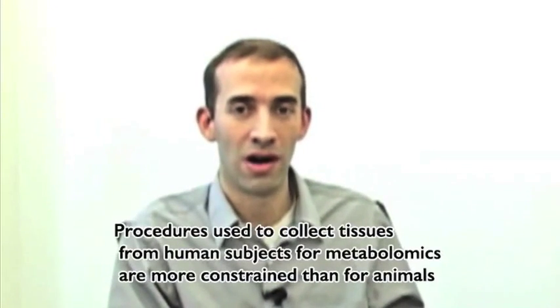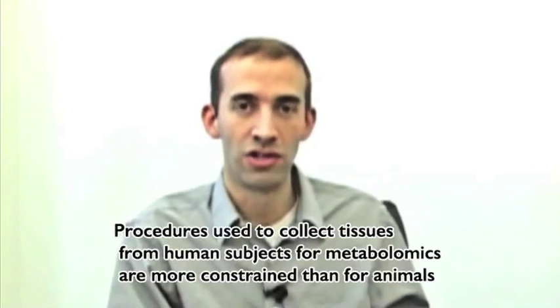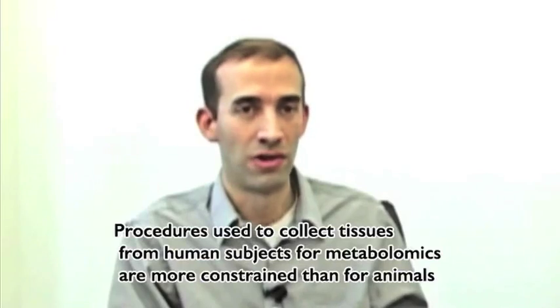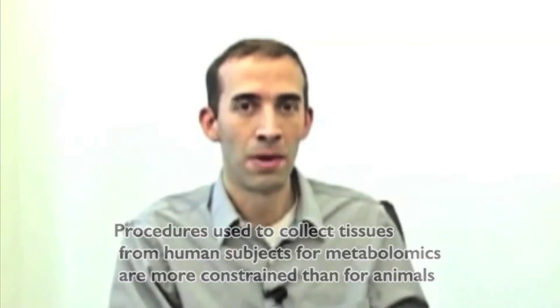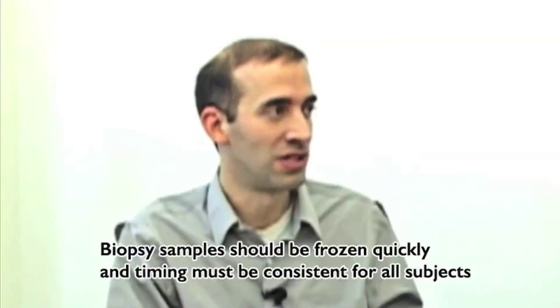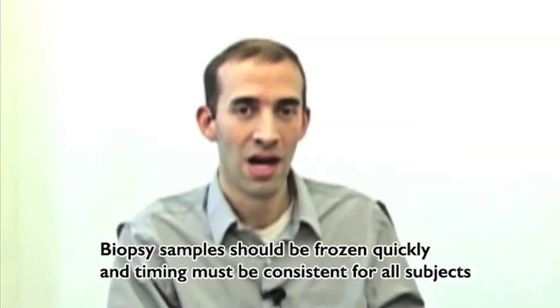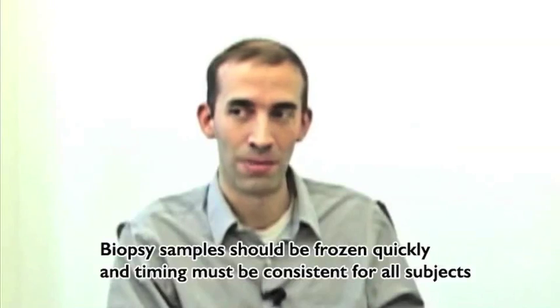Typically human samples are accessed by biopsy and very occasionally during surgery in collaboration with a surgeon. So there's a lot of constraints that are just imposed by that process in and of itself. But beyond that, the general recommendations would be the same as what we have in animals. It's beneficial to freeze the tissue as soon as possible after it's removed from the subject that you're studying, so by immersion in liquid nitrogen or by freeze clamping.